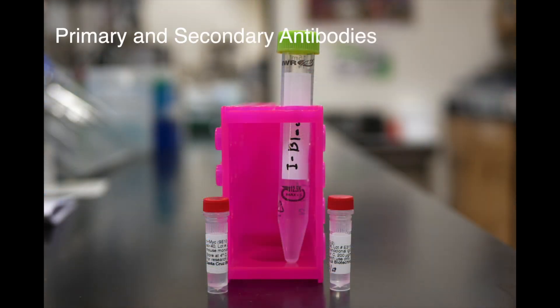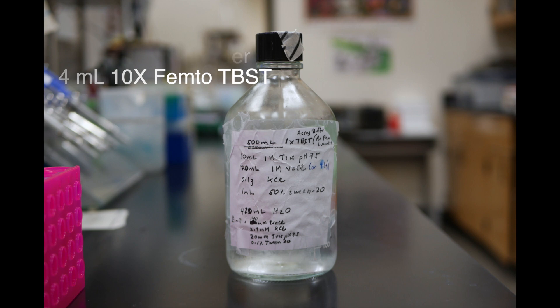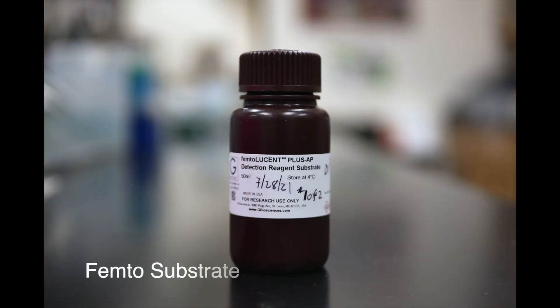We will need primary and secondary antibodies — about 10 microliters of the primary antibody in iBlock solution and about 2 microliters of secondary antibodies in iBlock solution. Next we need the assay buffer made of 36 milliliters of sterile water and 4 milliliters of 10x femto TBST. And lastly we need our femto-substrate to visualize our proteins.